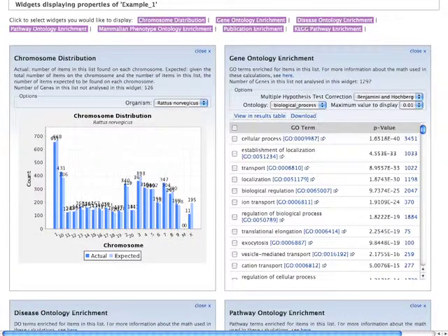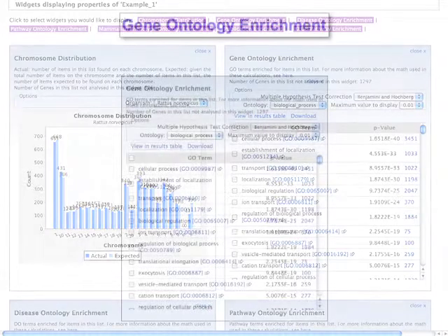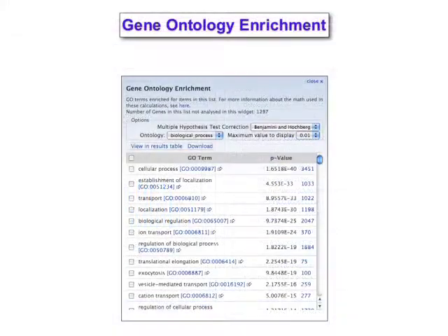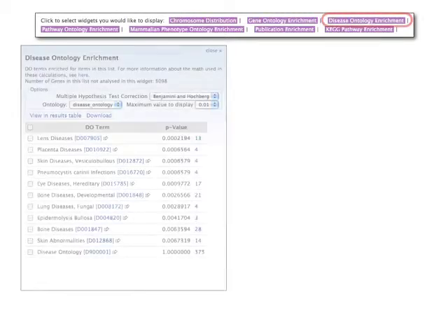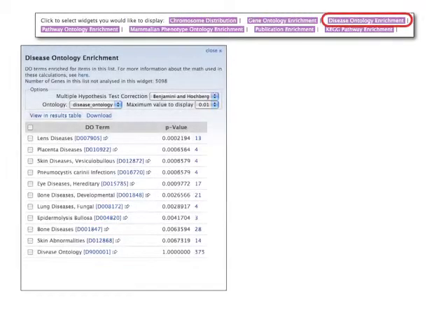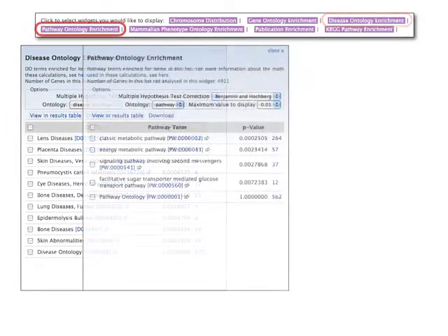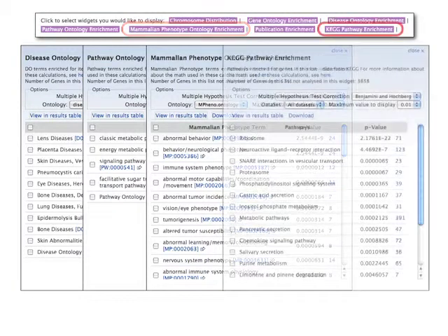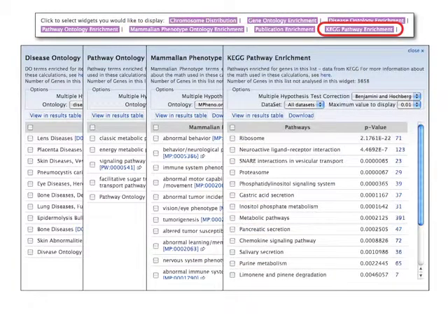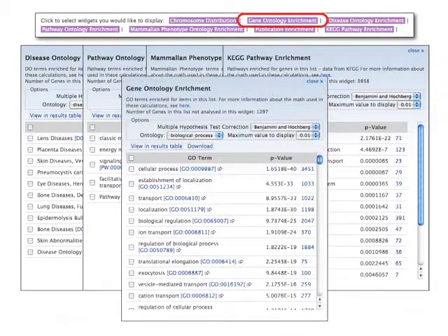As you can see, unlike many online enrichment calculators which use only the gene ontology, RatMine includes data for all of the ontologies that are associated with the genes in RatMine. These include a disease ontology, RGD's pathway ontology, the mammalian phenotype ontology, and the KEGG pathways, in addition to the gene ontology.